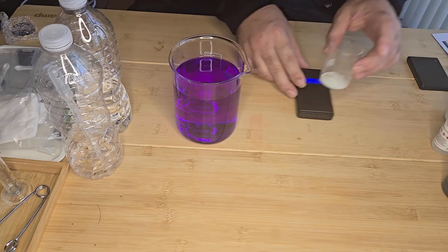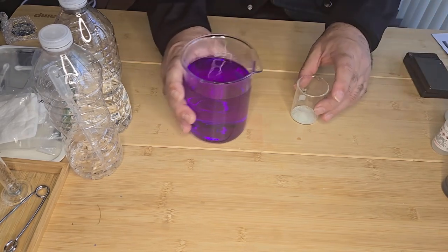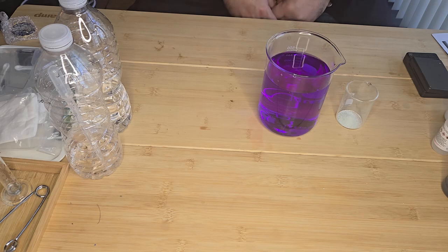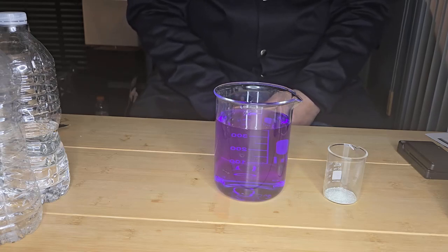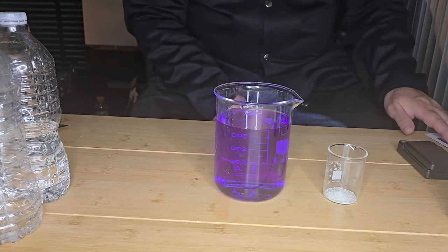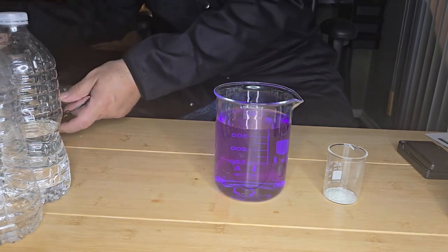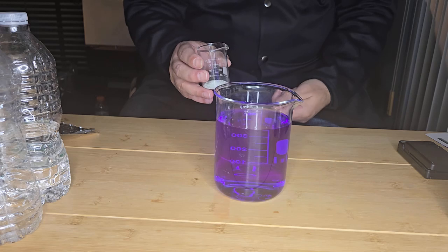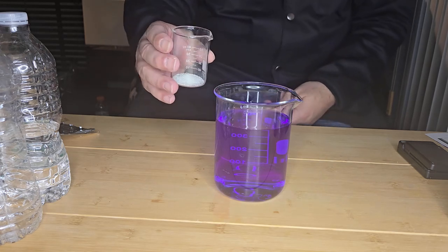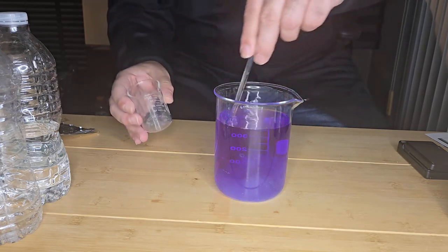But before I add the iron to the solution, I'm going to make the room a little dark. So what I'm going to do now is I'm going to add the iron.